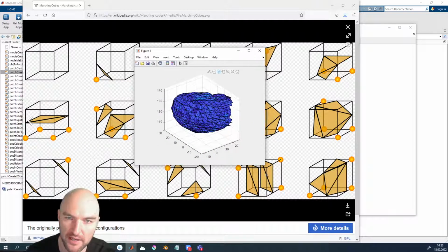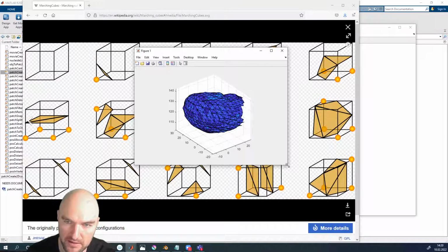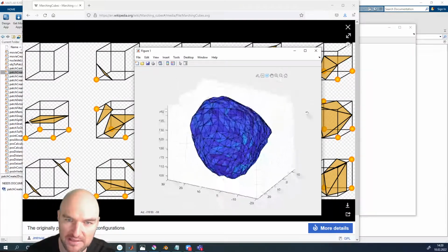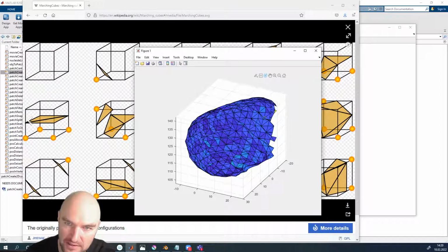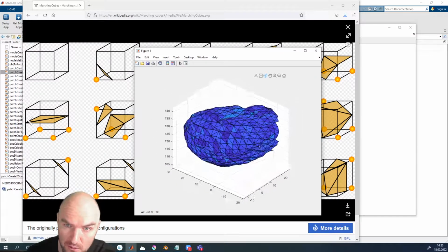By the way, the concentration map has finished calculating. Obviously, there's not a lot of gradient in there, but we can see, for example, that here, you have some very small triangles, and we might want to get rid of those small triangles in one way or another.